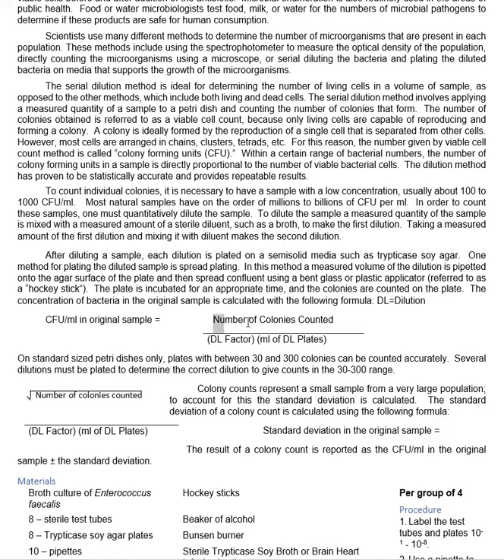So we take the number of colonies that we've counted, say I got 50, divided by the dilution factor, that would be the 10 to the minus, say, 4, times the milliliters of the diluent plated, which remember is 1/10 of a milliliter, 0.1. So you multiply that out, and then you divide the number of colonies by that number, and that gives us our CFUs per milliliter.